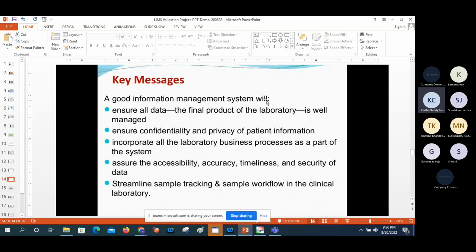When the lot was generated, when the sampling was done, when the analysis was performed, when the review was done, when the lot was disposed, this entire workflow performed by all the business persons like analyst, supervisor, reviewer, approver, we can track easily, and we can see where the status of that particular sample associated with the lot is in the system. We can easily track it at any time by opening the system.